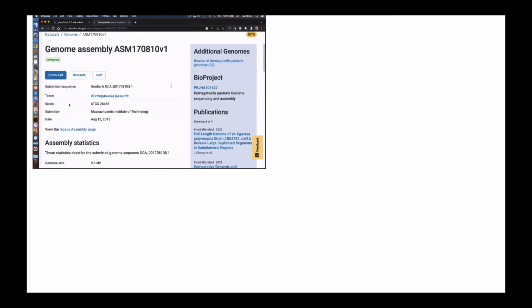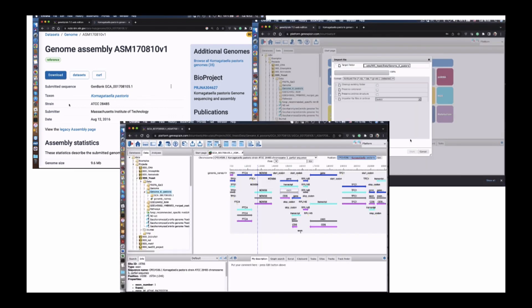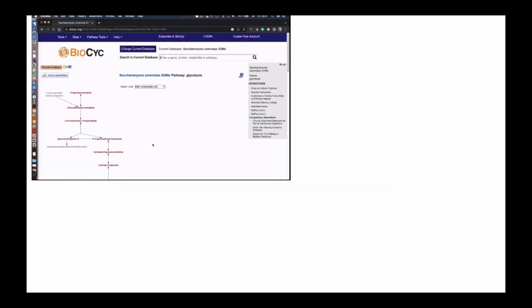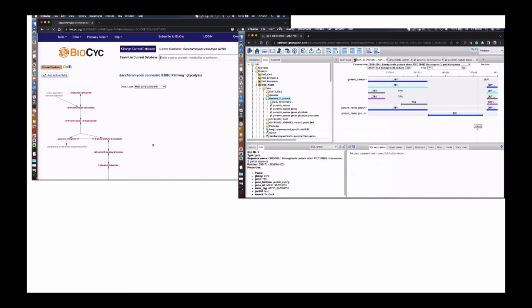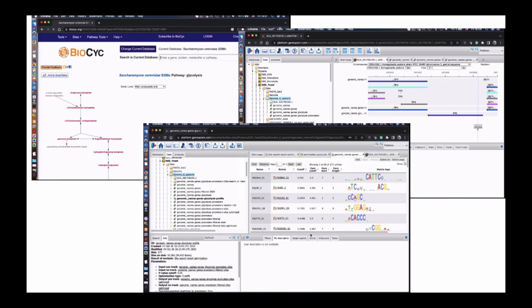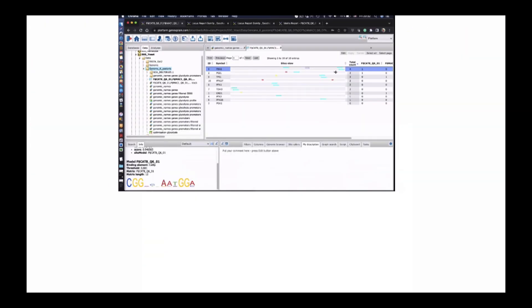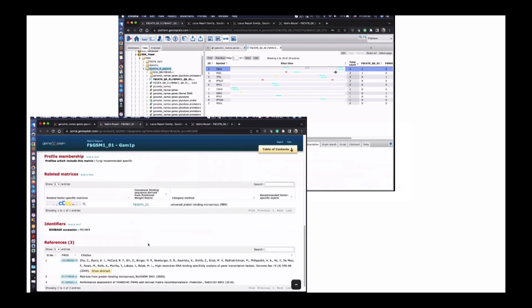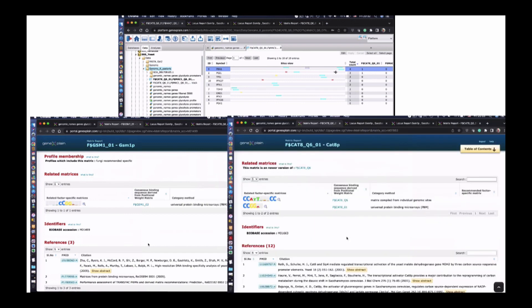In summary, we took the genome of Komagataella pastoris from the NCBI database, uploaded it into the GeneXplain platform, and also uploaded the gene annotation. Then we took genes from the BioCyc database which belong to the glycolysis pathway, extracted promoters for those genes, and found enrichment of transcription factor binding sites in the promoters of glycolysis genes. We identified that the top enriched transcription factor binding sites — including the GSM1 and CAT8 transcription factors — are actually known to be involved in glycolysis regulation.